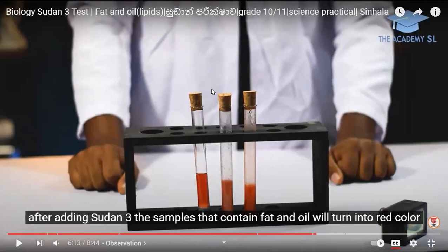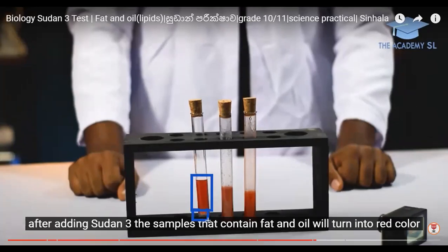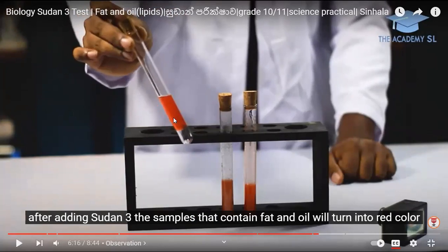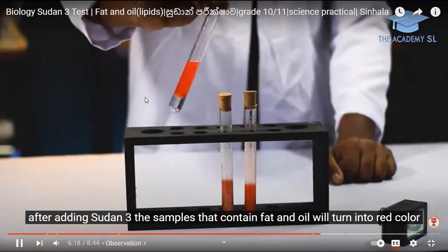In the first test tube, at the top, there is oil. Below that one, there is water. Does the water get the Sudan 3? No, it is staying as a transparent material. The only oil part is collecting the Sudan 3. Correct? Yes.